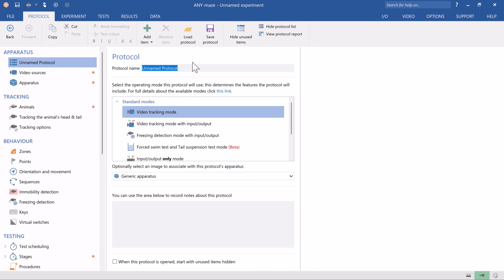One way to speed up experiments in AnyMaze is to track multiple apparatus simultaneously. Clearly, if you track 4 pieces of apparatus at the same time, it'll take you a quarter of the time to track all the tests, compared to just tracking one. This benefit can easily be applied to video files as well, even if the tests were actually performed one after the other.